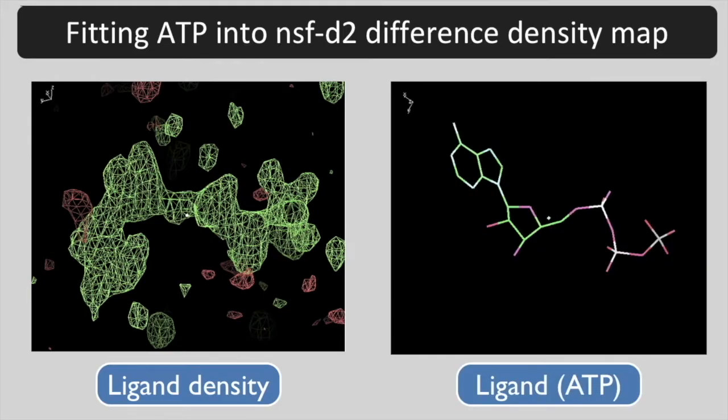Here is the difference density map that shows the ATP. And here is the ATP molecule that we would like to fit into this density. Notice that it is not clear just how to change the conformation of the ATP and put it into the density. The advantage of ligand fit is that this can be done for you automatically.